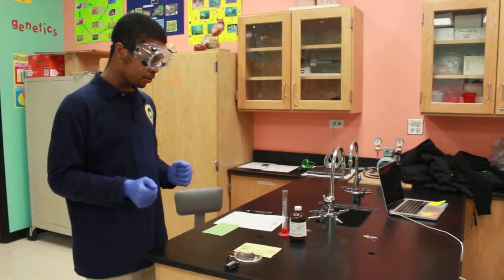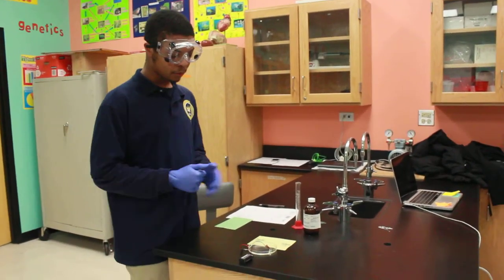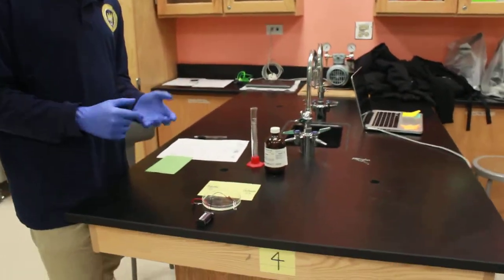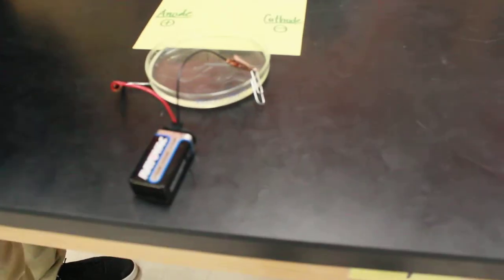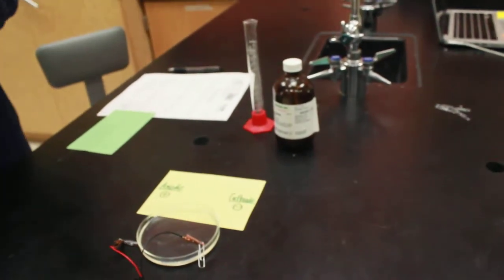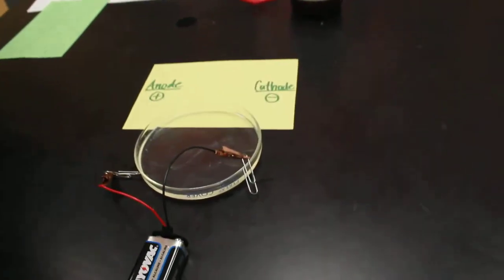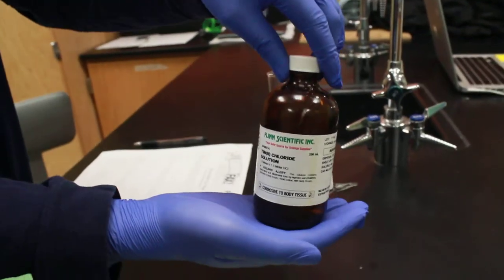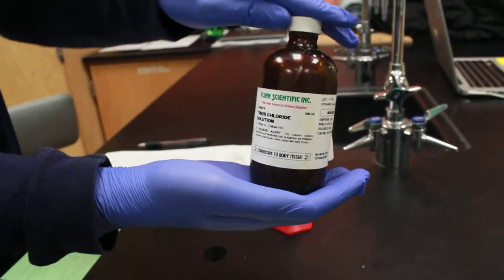For this experiment, we will need a 9-volt battery, a 9-volt battery cap, alligator wires, alligator clips, paper clips—small, they have to be small—and the tin chloride solution, that's one molar.